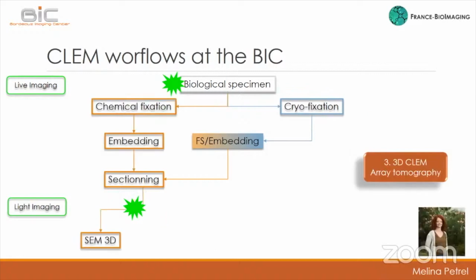Then Melina Petrel will be starting work talking about the 3D CLEM, where they have really advanced microscopes and protocols to first do the 3D reconstruction from the images from hundreds of serial sections, both in light and in electron microscopy, and then to be able to correlate them, and what strategies are being taken.